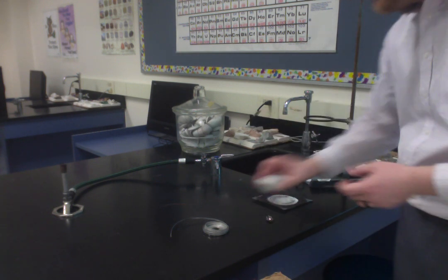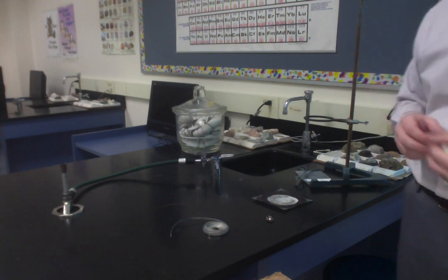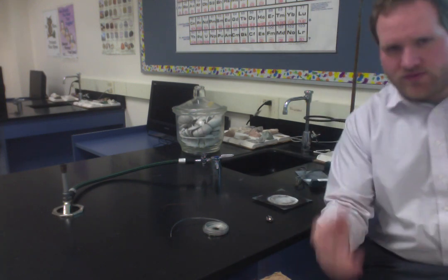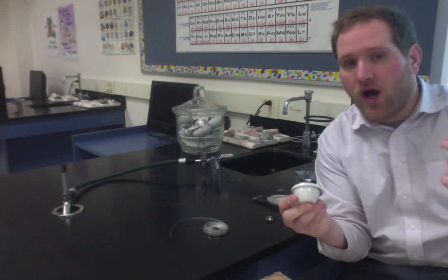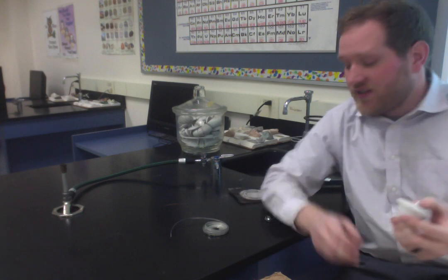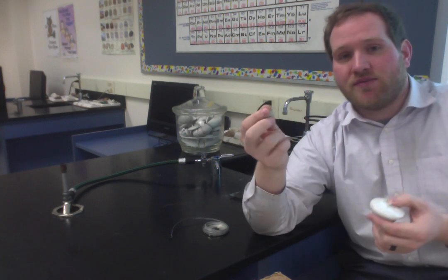Okay. Now we need to burn the magnesium and calculate how much oxygen bonds to it. And before we work out how we actually do that, let's figure out what we can expect. So when we burn the magnesium, what do you expect the mass to do? Well, it should go up because it's going to bond with oxygen in the air. And as you could probably imagine, that's how we're going to find the mass of oxygen. You're going to take the before mass, burn it. You now have magnesium oxide, and you're going to find the difference in mass.